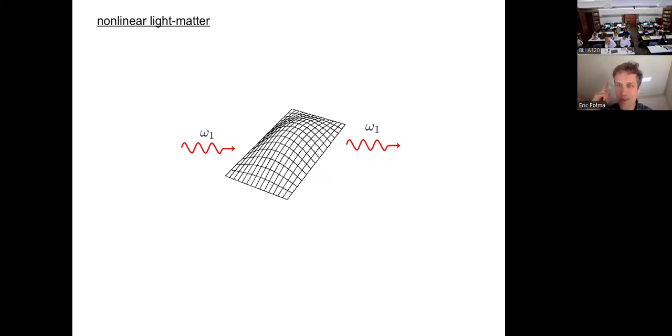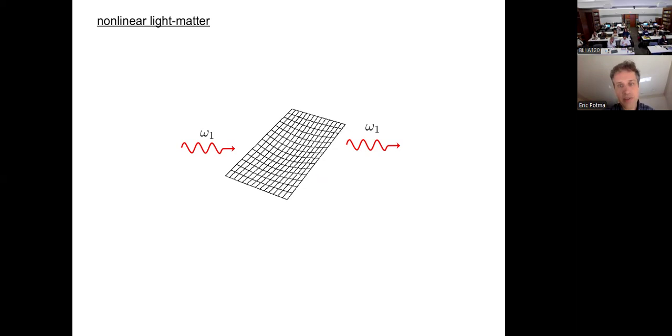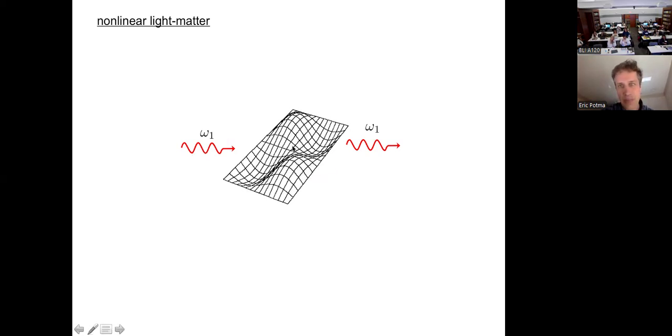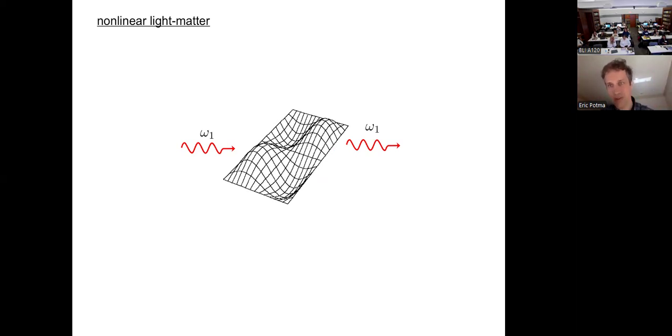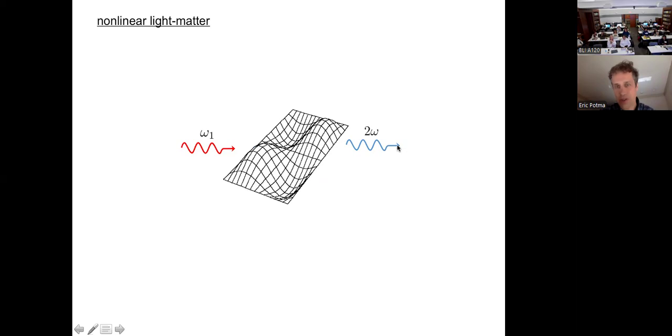That's an overtone. That overtone is an indication that your membrane is not oscillating only at the original tone, but actually oscillates at higher frequencies as well. And that is a nonlinear response. So if I drive really hard, then this membrane actually starts to pick up oscillations that are overtones of the original. And so what you get out, in fact, is the color of the overtones.